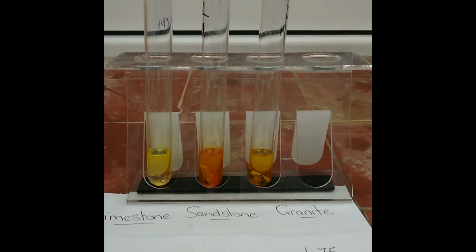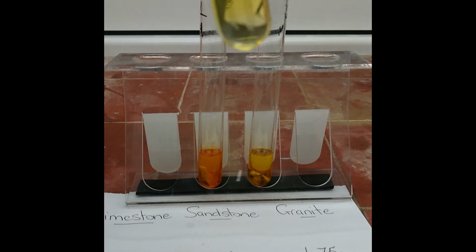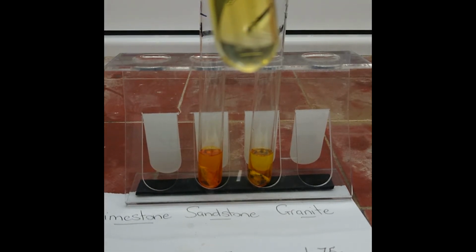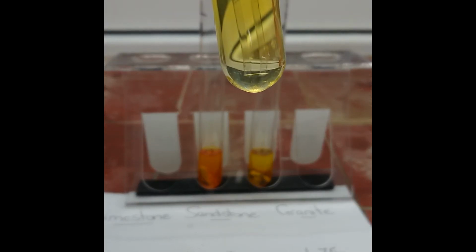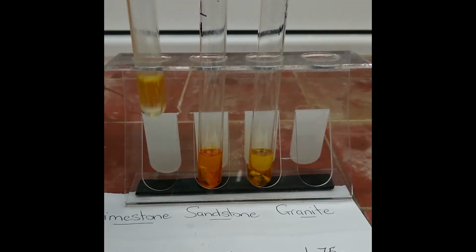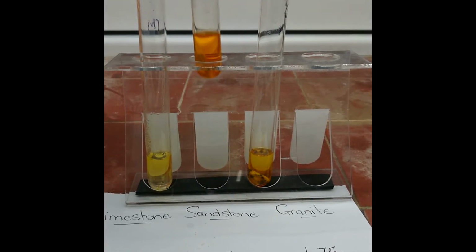Hello all, it's been nearly 24 hours since the last time I checked these. I added a little bit more acid about halfway through, but I did it to all of them so it's nice and even. As you can see, the limestone is completely dissolved, as it would be in nature if over a long period of time a small amount of very weak acid was added.